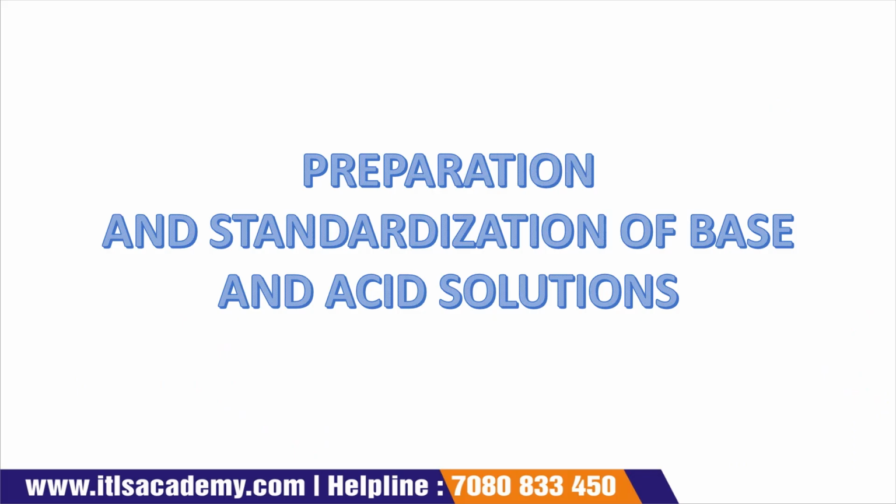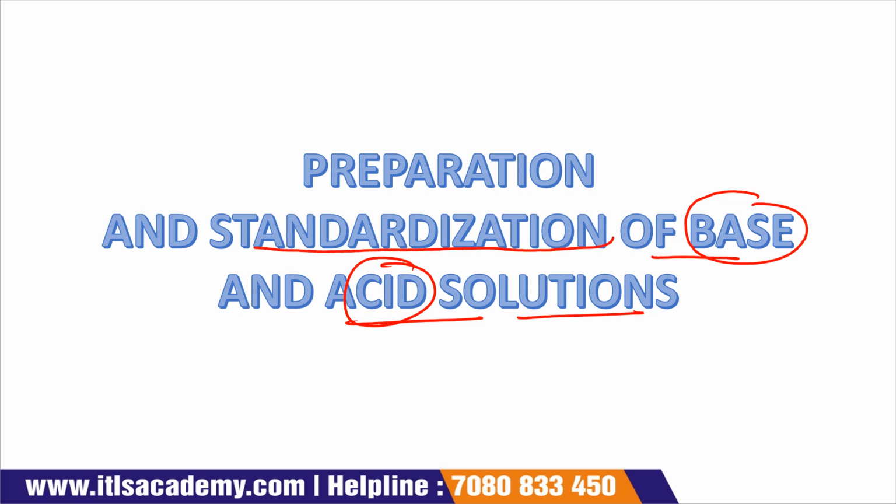Today we are going to discuss the topic of preparation and standardization of base and acid solution. Here we are going to see that we have to prepare our acid solution and a base solution, and along with it we have to do a standardization of this acid and base. So today we are going to discuss this.